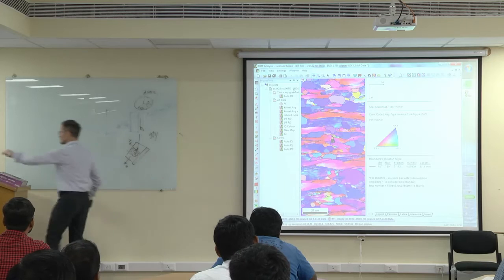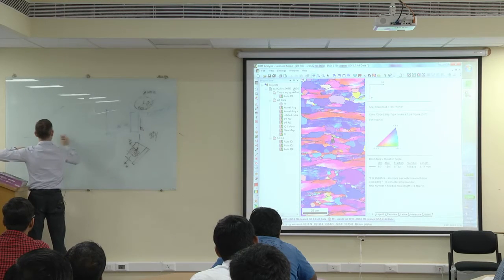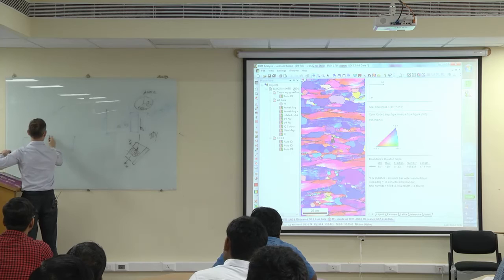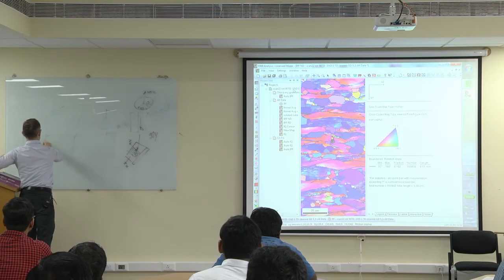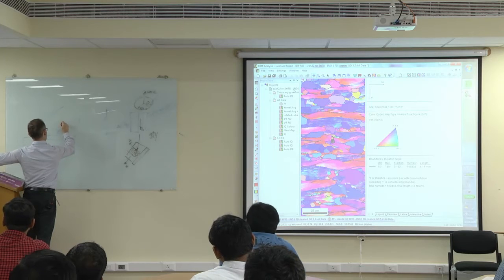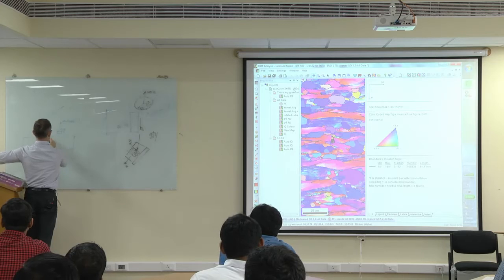That means, if I plot that again, a grain which appears here in red on that surface means that the grain has its normal direction in this plane here. So this one here, ND, is parallel to 001. Then it appears in red here.